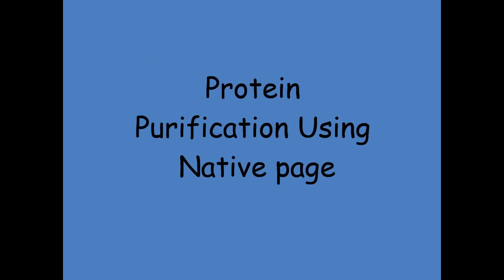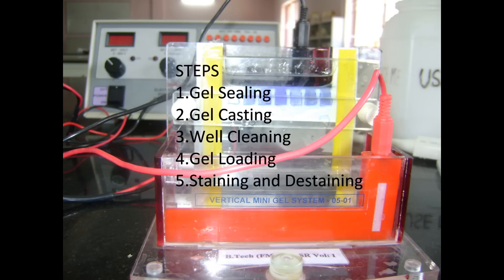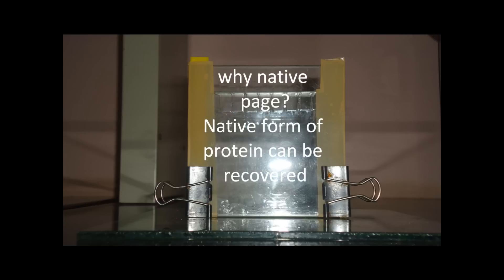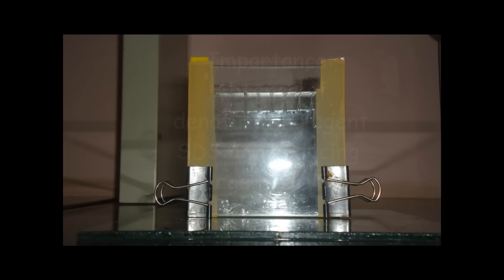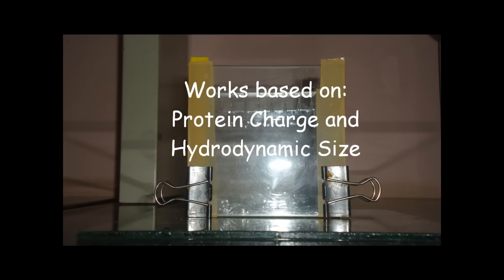Protein Purification Using Native PAGE. The steps involved are described below. Native forms of protein can be recovered in this method. The importance of Native PAGE is that it is based on protein charge and hydrodynamic size.